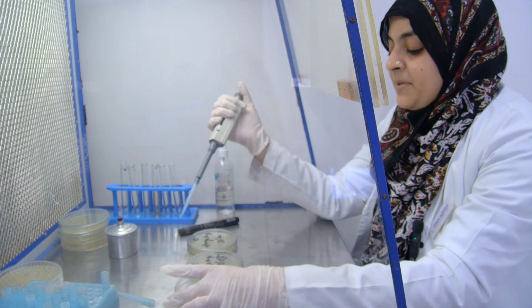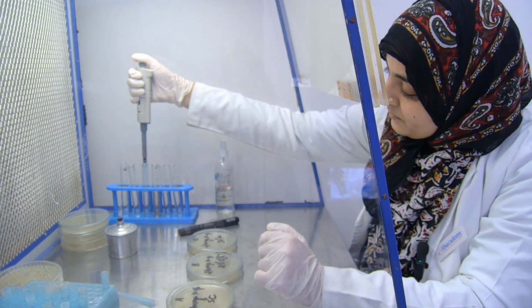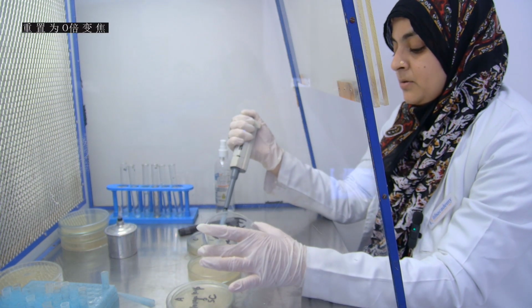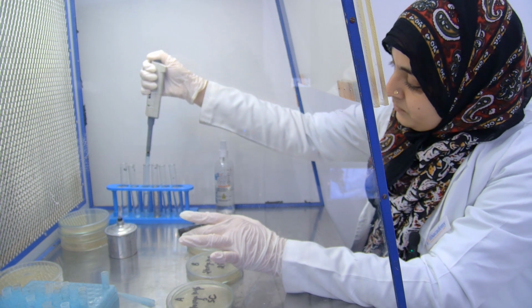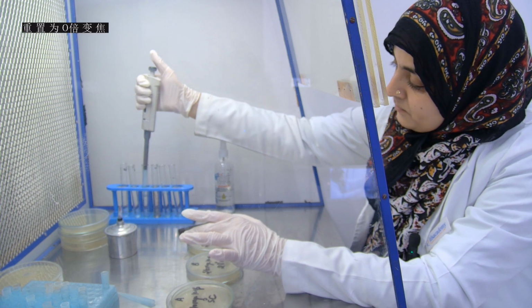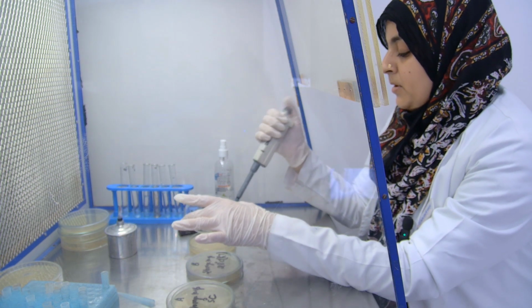We take the same dilution for each Petri plate. Then inoculate the second test tube. And inoculate the third test tube.